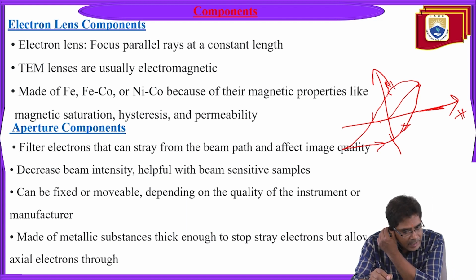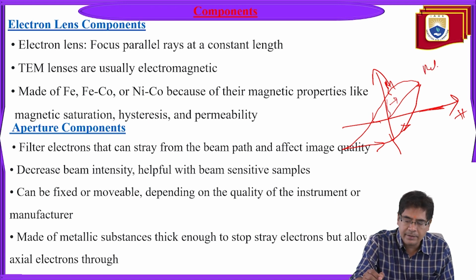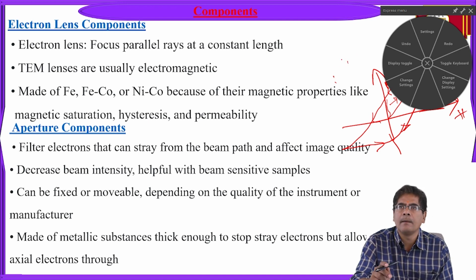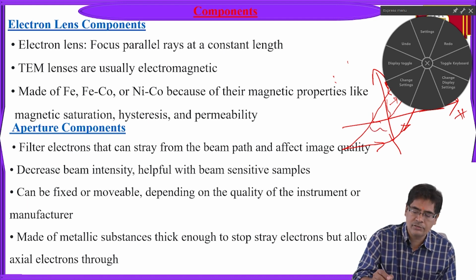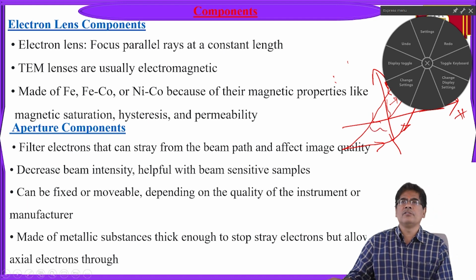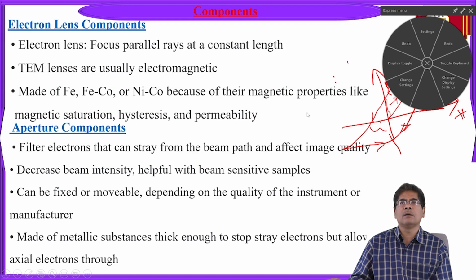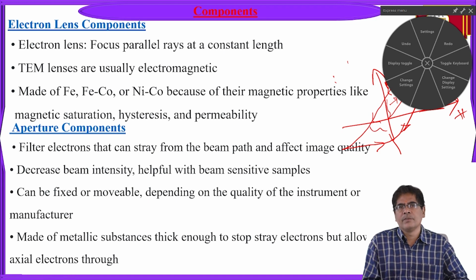The reason behind taking the reverse path is due to parameters like retentivity and the coercive field. Due to this, it follows a different path. And we have one more parameter, permeability. Permeability is nothing but the lines of force that we see on the sample.